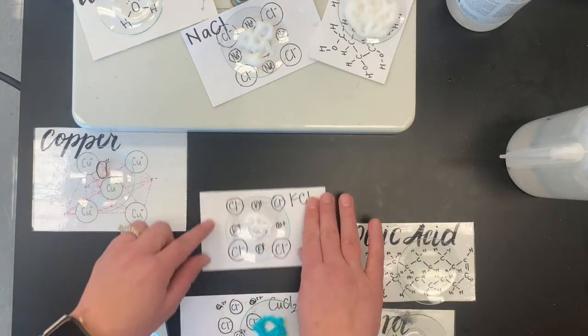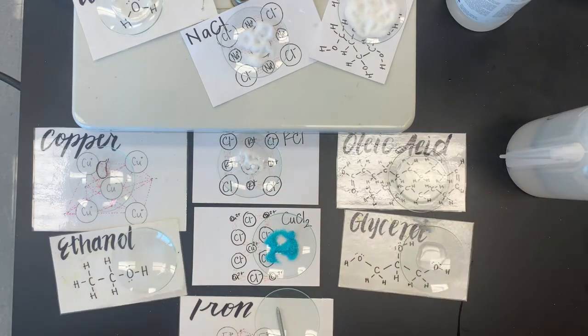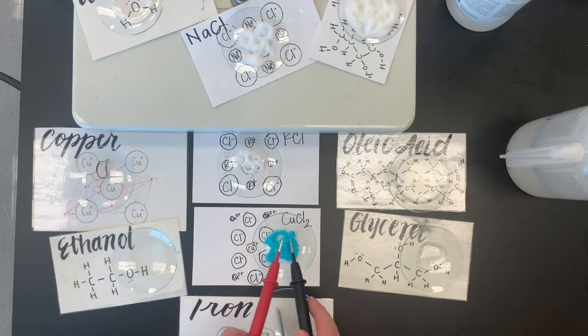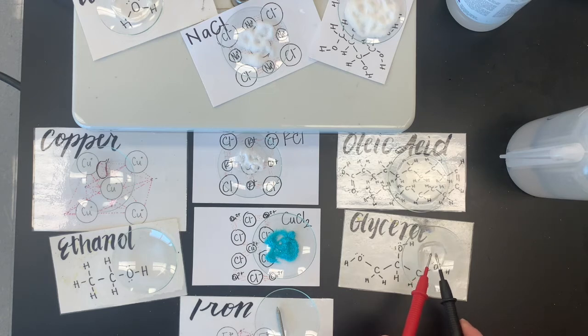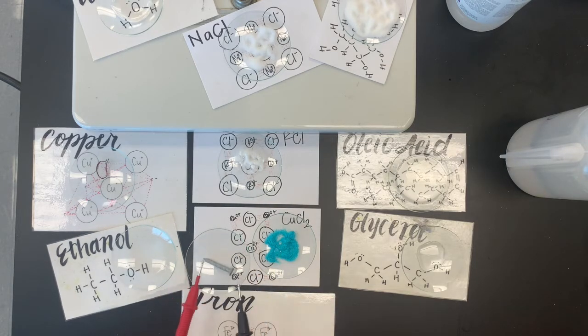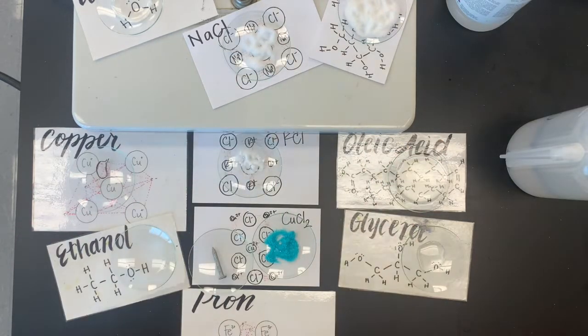So we saw the copper. So let's try our ethanol. See if it conducts. Looks like that's a no. Copper two chloride. Also a no. Glycerol. No, this is not very fun. And then iron. That's a yes, boom, boom, boom. Can you even see it? Let's make sure you can see it. So now we know what conducts as a solid and what doesn't.